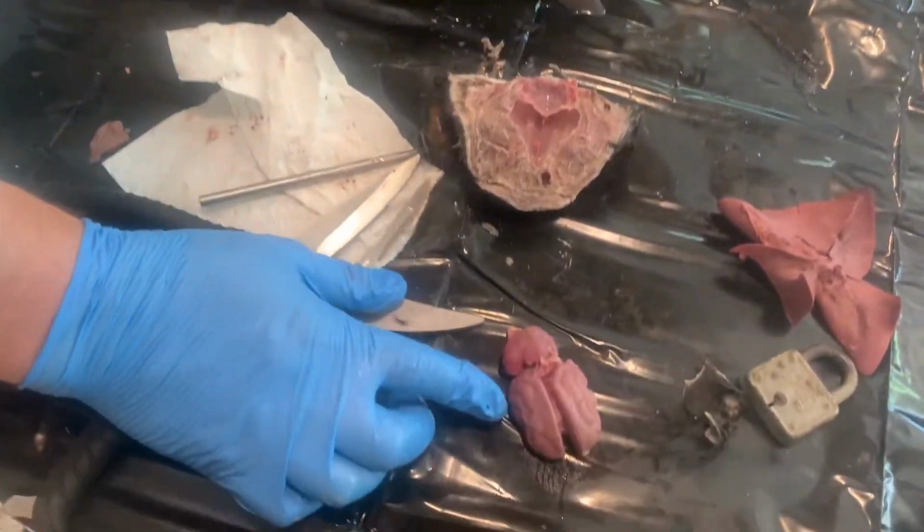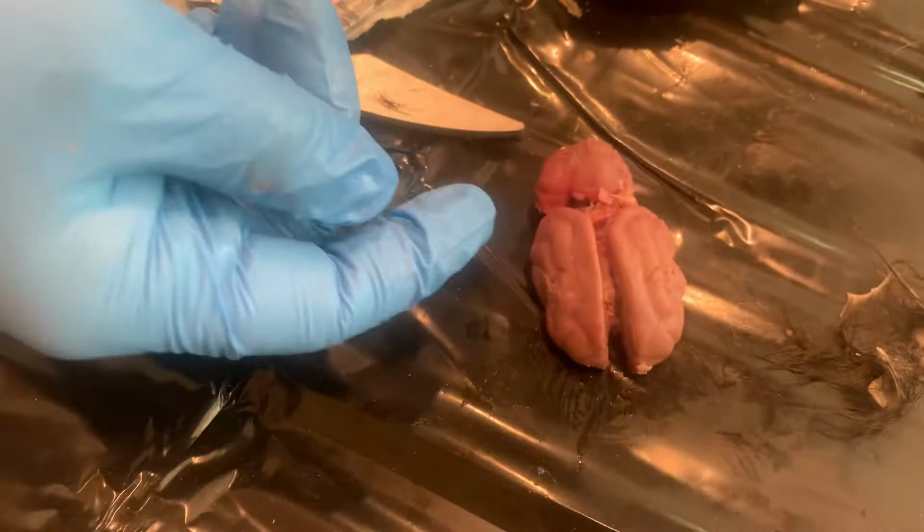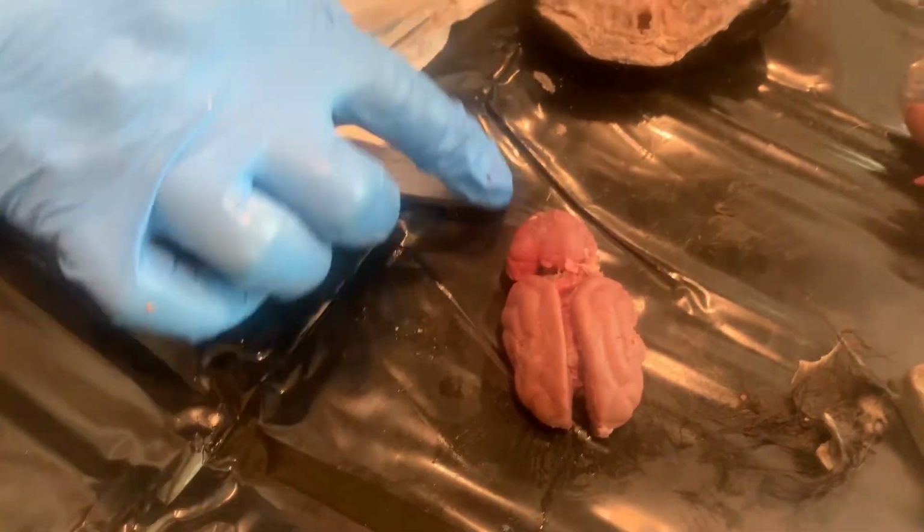This dissection, the person who did this dissection did a really good job. It has the brain pretty much intact. Cat brain's much smaller than a human brain. You have the cerebrum, you have the cerebellum, and then you have the brain stem down here at the bottom.